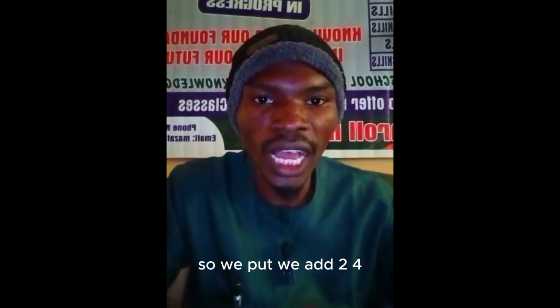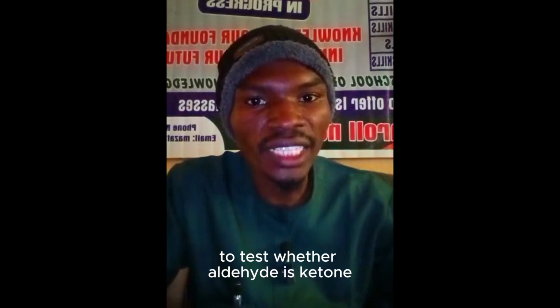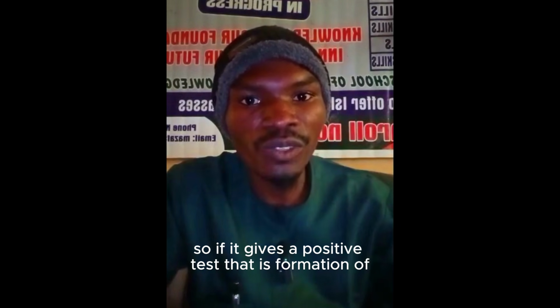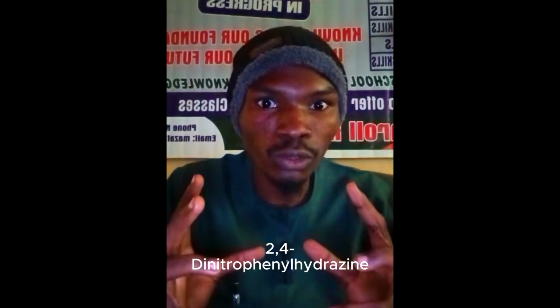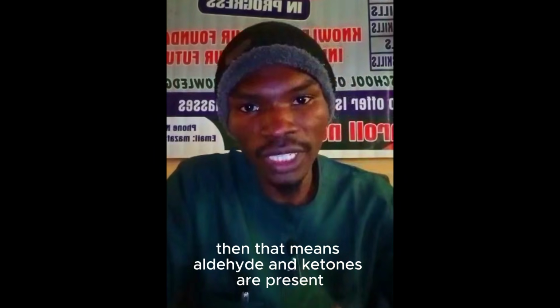So we add 2,4-dinitrophenylhydrazine to test whether aldehydes and ketones are present. If it gives a positive test, that is formation of 2,4-dinitrophenylhydrazone, then that means aldehydes or ketones are present.